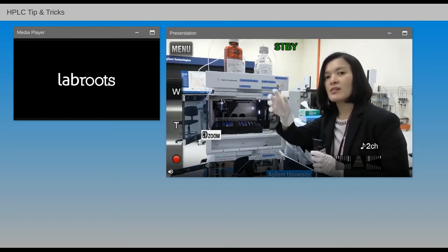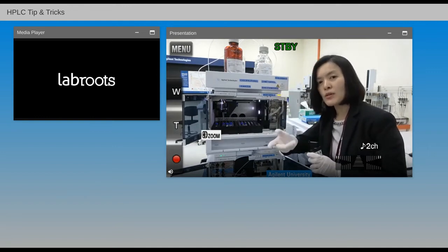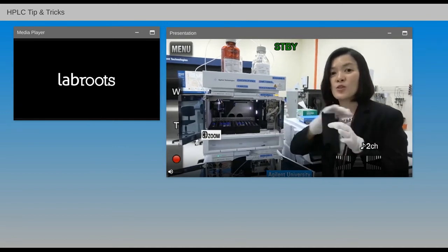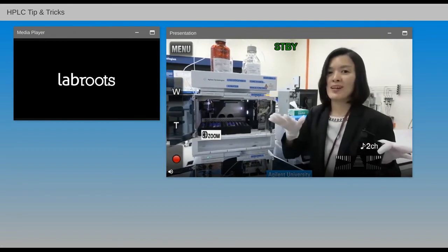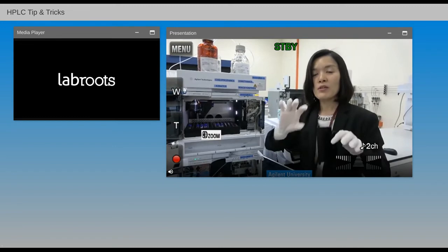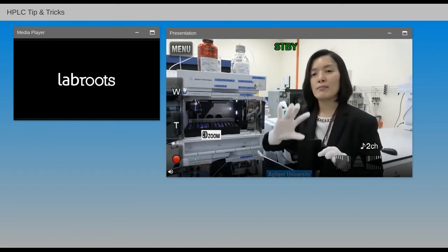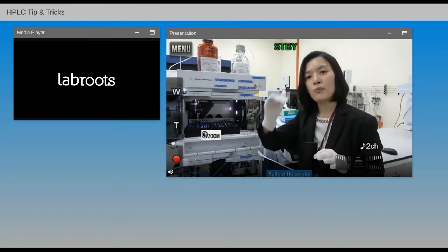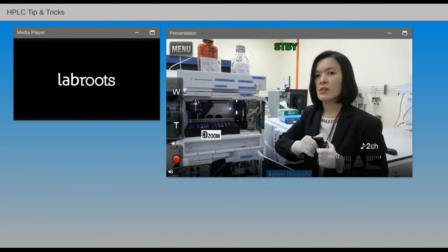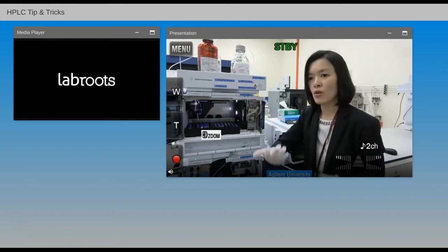It will switch between bypass or main pass. When it's in bypass mode, it bypasses the needle and needle seat. When it's in bypass mode and the pressure is good, meaning low and optimal, it means that the choke is coming from the needle and needle seat. But when you switch to bypass mode and the pressure is still high, meaning in both bypass and main pass the pressure is still high, it means that it is not due to the needle or needle seat. Or it could be somewhere else, but the problem is still not resolved yet.